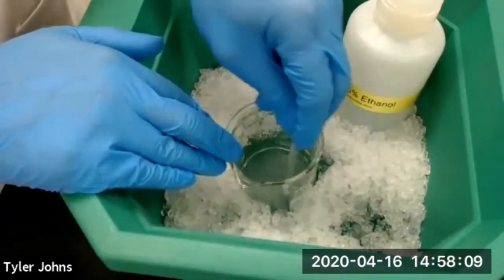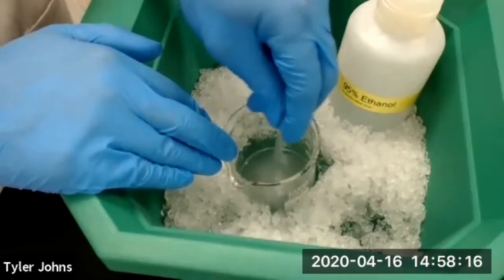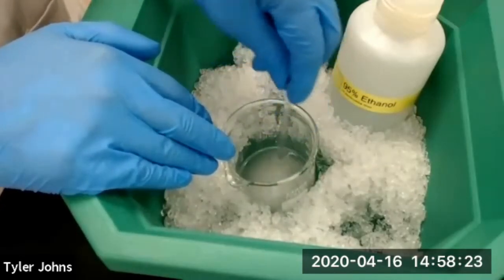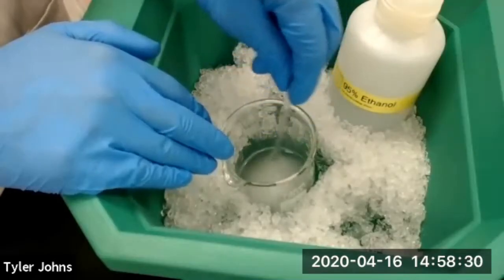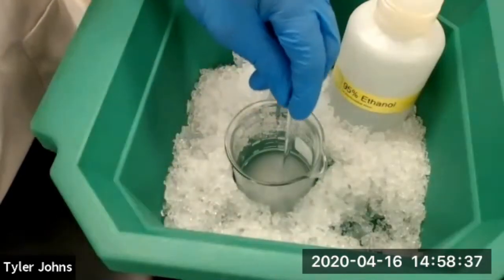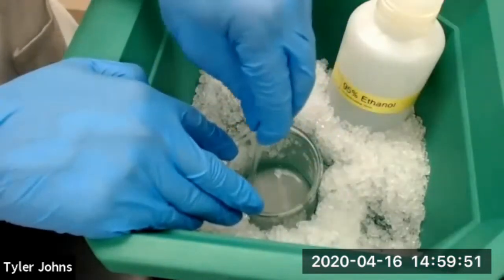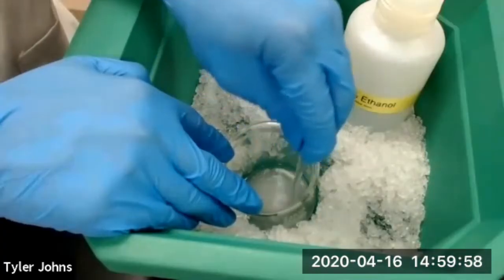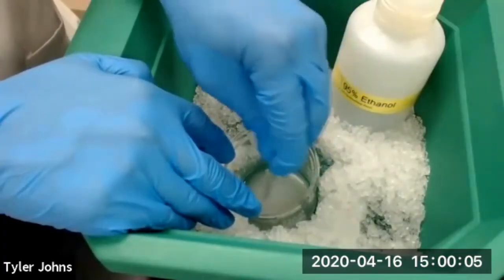Okay, so hopefully you can see, I've been stirring it for about 2 minutes or so. I'm continuing to stir. But you should see that I'm starting to get crystallization occurring here, and see the white crystals forming inside the solution. I'm continuing to stir on the ice bath. And you can see that we have our alum crystallizing, or potassium aluminum sulfate dodecahydrate. That's the particular alum that we are synthesizing in this experiment.